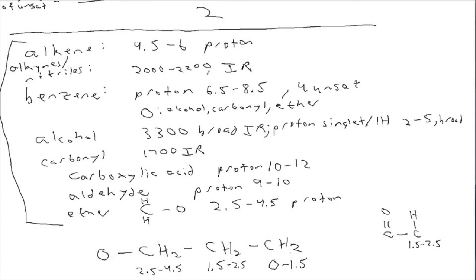I just looked at the first 6 problems. And if you look at the first 6 problems, none of them have any absorptions around 2200. So it is pretty distinctive when you see an absorption around 2200. That's a very strong clue for a triple bond. So that's an important thing to add to your toolkit. So IR is especially helpful. That would have been very helpful to you on this problem to figure out that there's an alkene and a nitrile. It's obvious there's an alkene because of the 4.5 to 6 absorptions. And if you notice the 2000 to 2200, then we can see that there's also a nitrile as well. Because there's a nitrogen, we should be checking if there's a nitrile, and then we can confirm that.